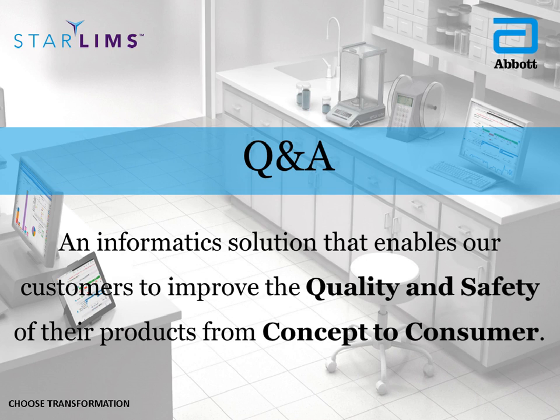So either or. And when it comes to patient data, what we have in the content library is just an example, but when it comes to the customer implementation, we need to check what the customer needs are, because not all customers have the same patient data collection requirements. So it will vary. If it's research, it's typically just an ID, and that's it. Many times we don't get more than that.